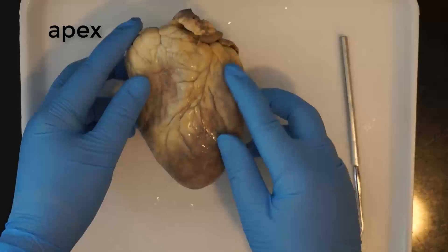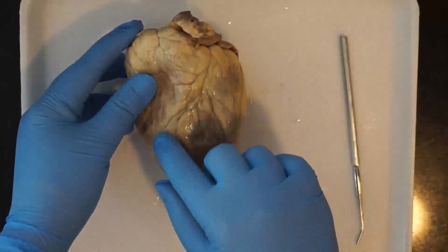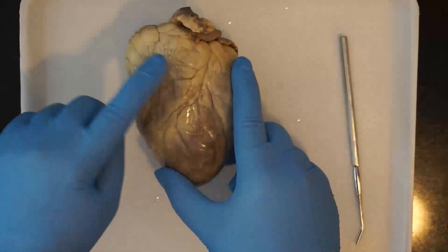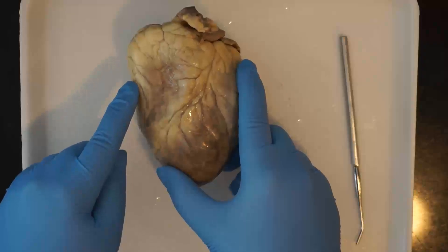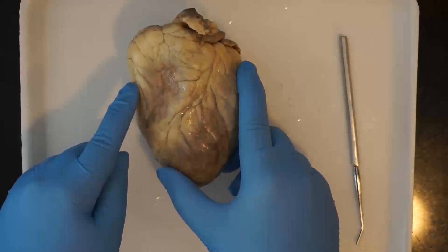Take a look again at the interventricular sulcus and you'll see that the left ventricle is significantly larger than the right ventricle. That's because the left ventricle is responsible for pumping blood to the whole body, so it needs more muscle than the right ventricle, which only pumps blood to the lungs and back.